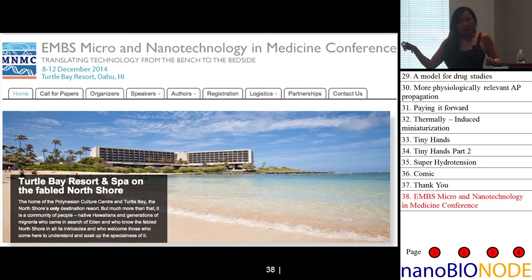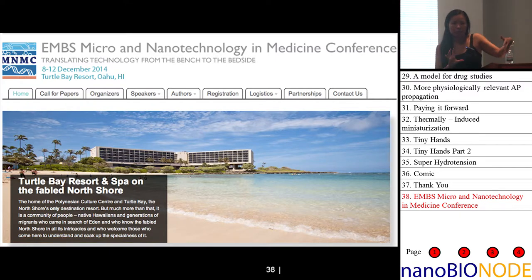So we map those out and then we have different drug studies. So we do dilutions of various types of drugs that would affect different parts of the heart cells. So one looks at contractility, another one looks at calcium channels, calcium transport. So then we look at the differences in the contraction, and then we basically bin them to see if it's being affected or not. And it's basically you're recognizing the pattern of an image, making the algorithm recognize. Yeah, exactly.